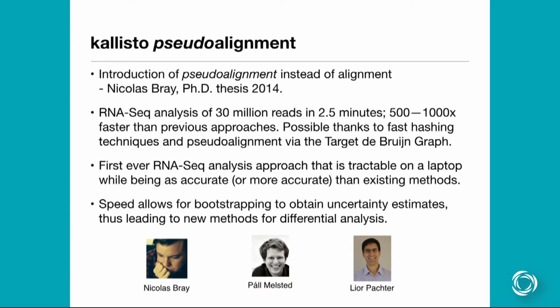So we have an algorithm, and I'll show you that in a second. Basically, the way it works, it builds some really clever data structures, and because of that, you can do quantification quite fast. In our benchmarks, we've been doing about 30 million reads in about 2.5 minutes. This is including quantification times, so it's anywhere from 500 to 1,000 times faster than the existing approaches, and you can actually do it on a laptop.